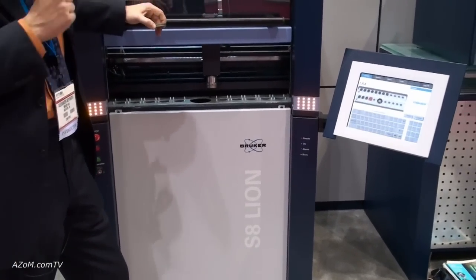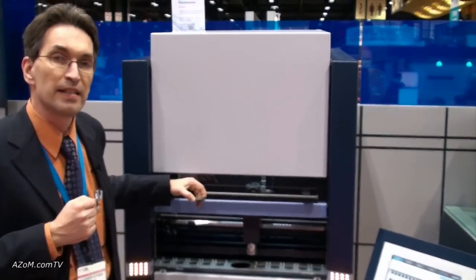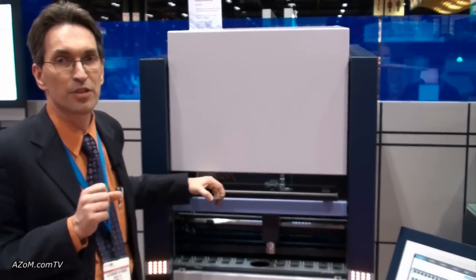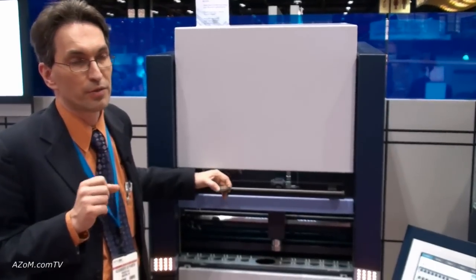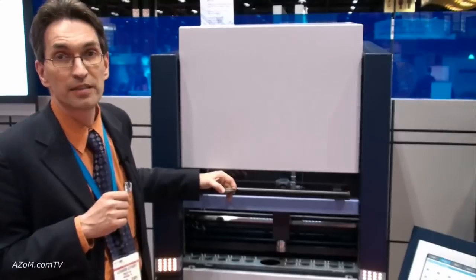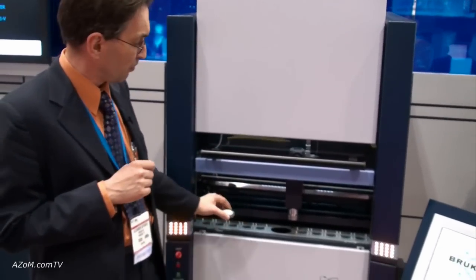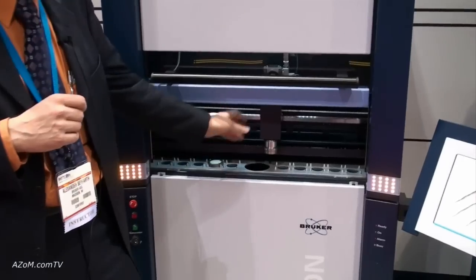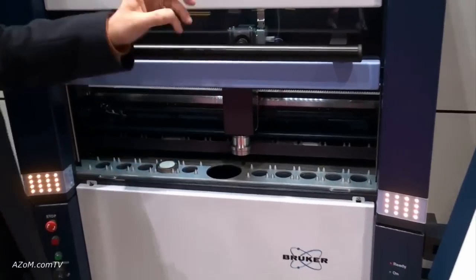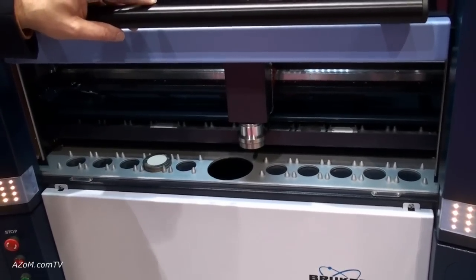The multi-channel unit is a dedicated system with up to 16 channels — dedicated element channels which you can freely configure. Usually you configure them for the main elements in cement and some of the trace elements. The sample is loaded directly with a grabber, goes inside, and gets measured within 60 seconds for all the elements.